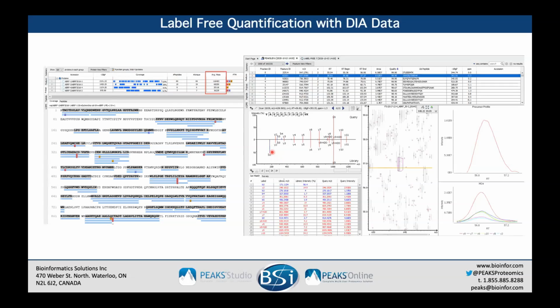From this data, you can see that your library match well, and you have nice relative percentage identifications between the ions. So Y9 ion's the biggest in the library. It's also the biggest in our query. Y6 is probably the next biggest Y, and so on. And a nice alignment of XICs.